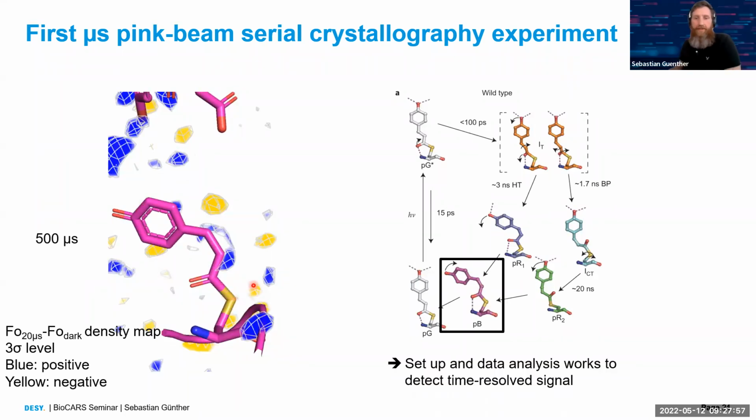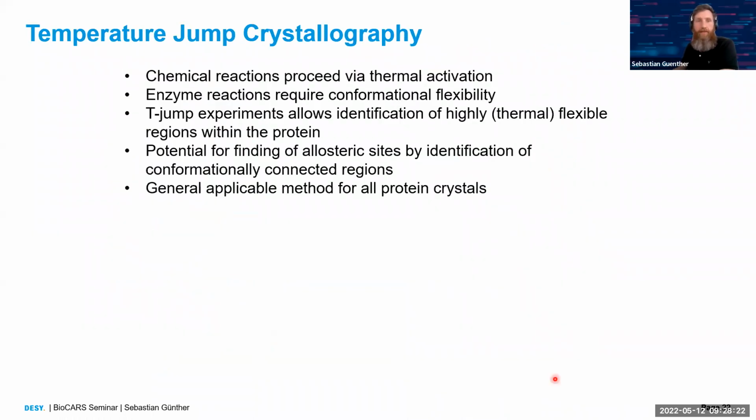So with this, we think we could show that the method itself, the light activation, and also the downstream analysis, which is running through CrystFEL and PinkIndexer, which was also developed in collaboration with the Henry Chapman group, is working quite well. So now we moved on to a different set of experiments.